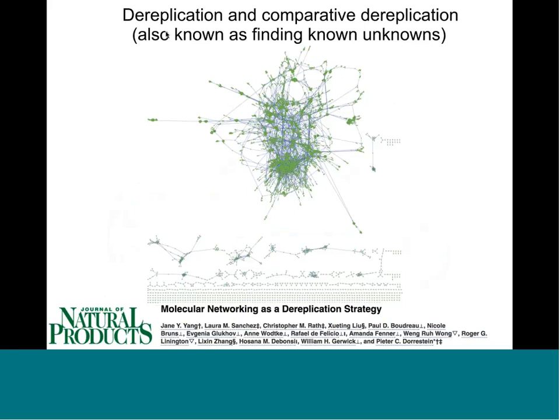And so you create this molecular network, and basically the way I think about this molecular network is that this is a map of chemical space that we were able to detect in a given untargeted metabolomics experiment. But then what is nice is that we can take reference spectra and we can begin to populate this particular map. And so what a typical project does when people do untargeted metabolomics and publish is they only publish these annotations and, in general, they ignore everything else. And this is unfortunate.